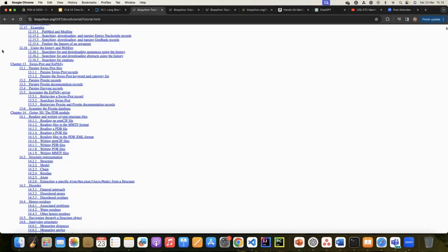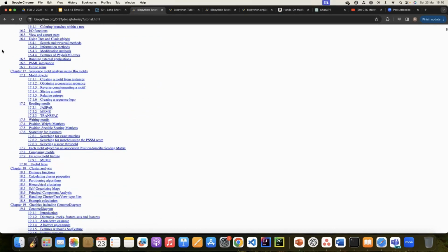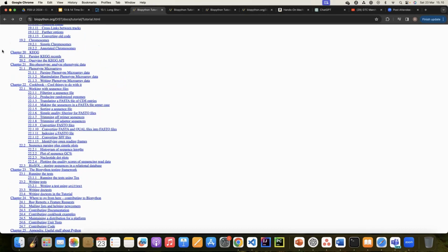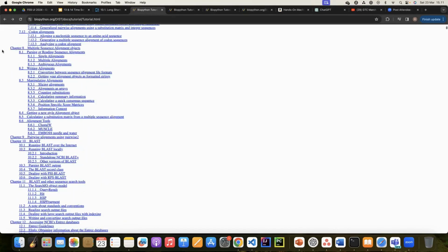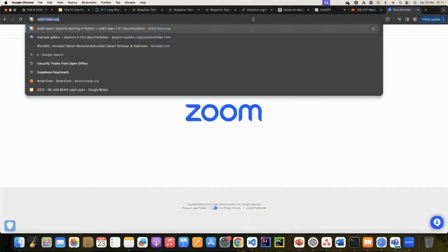Because there are so many features in Python that we cannot memorize everything, make sure you have scanned all of the capabilities. Copy paste the code so you can see how it works. So when you do code-based prompting, like Snakemake, Python, or Nextflow.